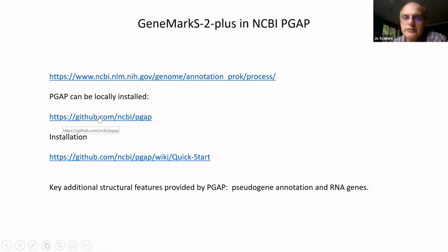It will give you functional labels, but because it does functional gene annotation, it runs a lot of additional analysis. So you could expect that every genome of a size of something like 4 meg will run 5-6 hours, while GeneMark S2 will give you a prediction in a couple of minutes.